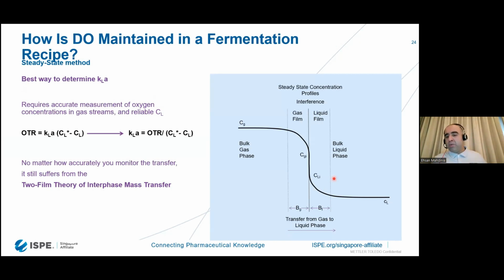For one, we're not dealing with water, so we're dealing with the real-time salinity and chlorinity. Of course, the steady state method with fermentation is the most accurate. But in this case, based on the thin liquid layer theory, the two-film theory, you need to fill up your fermenter with media, sterilize, bring the seed into it, start the fermentation as if you are running an everyday fermentation run, and then somewhere in the exponential phase, somewhere where cells are growing exponentially at a constant rate, then you have your window. Everything is constant. Growth is constant, consumption is constant, agitation and aeration are kept constant.